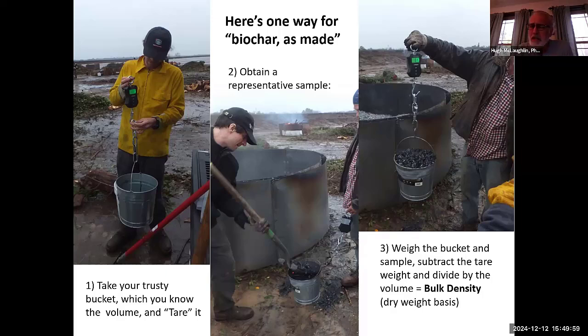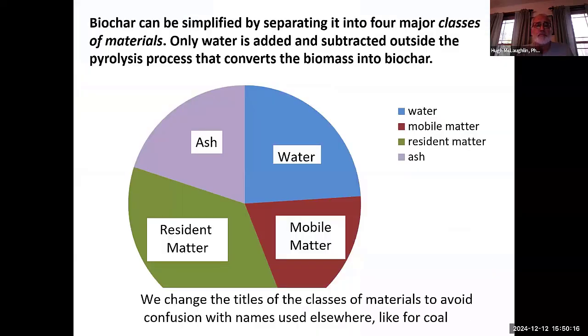So it seems crude, but frankly, it's not. And there are reasons for that, which is it's not hard to measure density, but it's hard to measure density to many significant figures, and I'll show you.